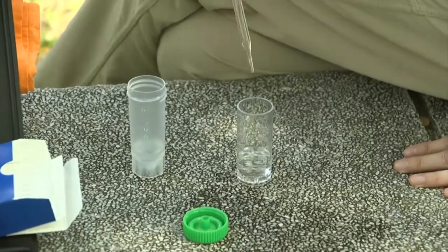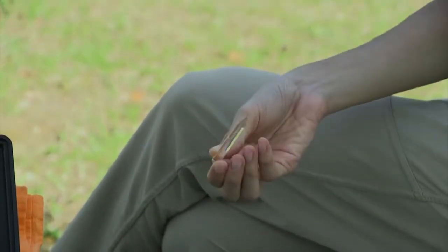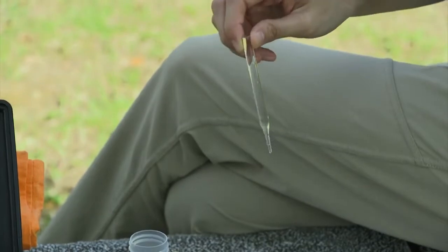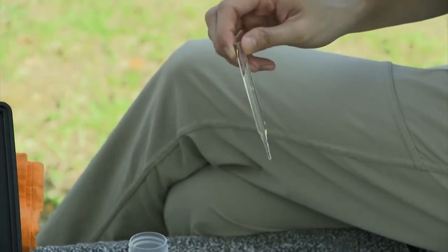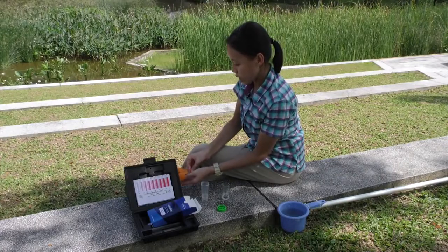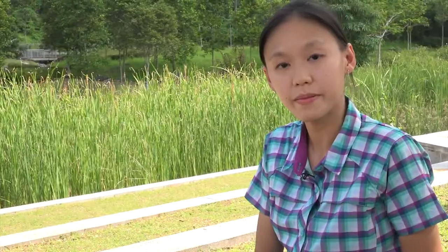Mix the ampule by inverting it several times, allowing the bubble to travel from end to end. You can then dry the ampule and wait 10 minutes for colour development.